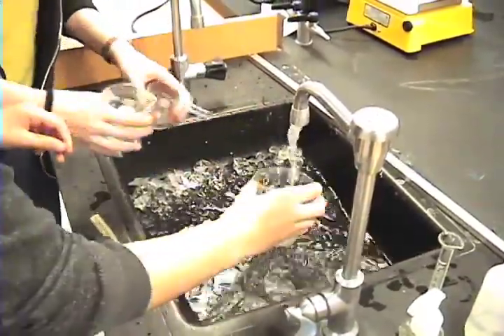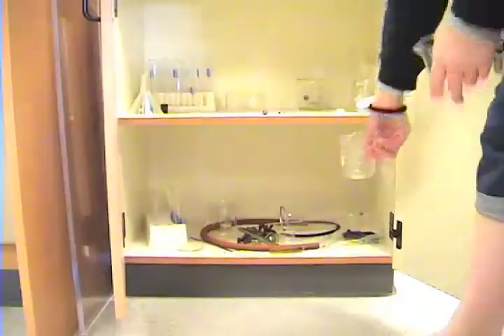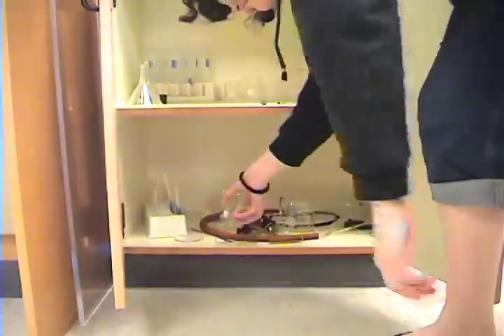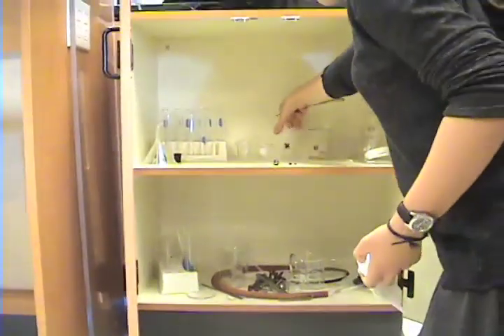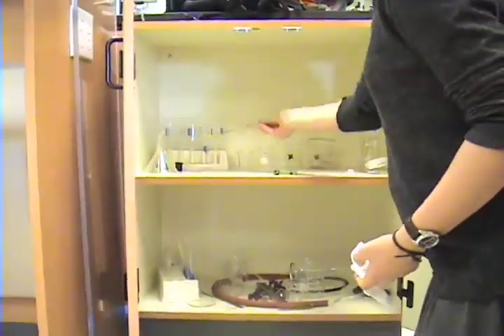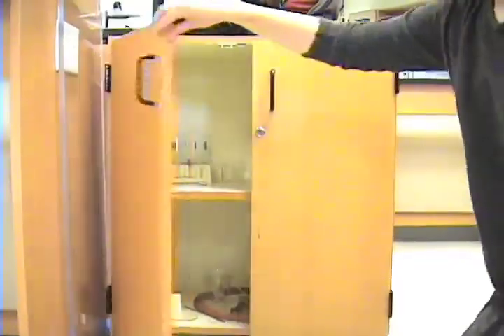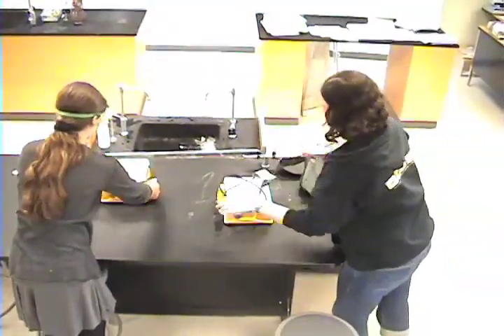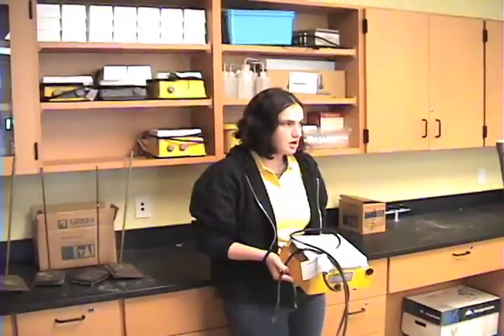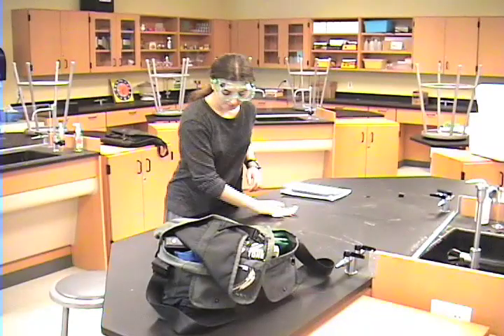Clean up is an important part of the lab. Wash carefully using a scrub brush and put things away in their correct place. Be careful, take pride in having an organized workstation, and secure your lab locker. Clean your surface, leaving it ready for the next student. Be a considerate chemist.